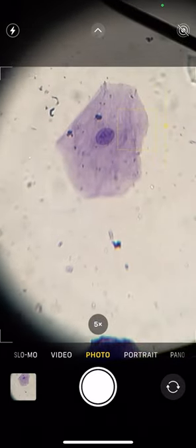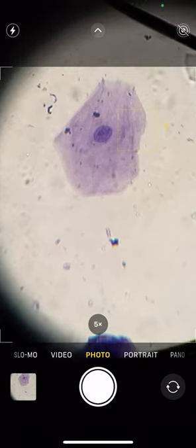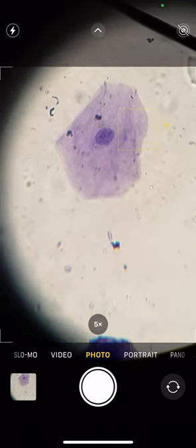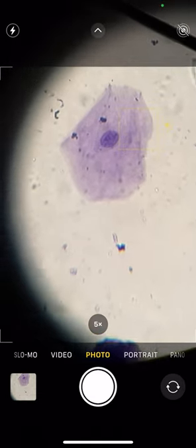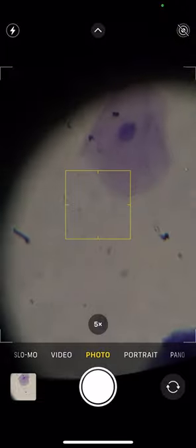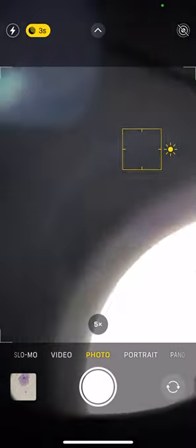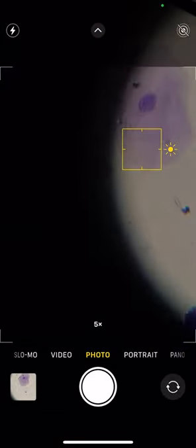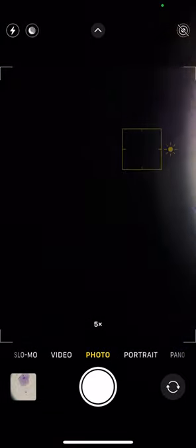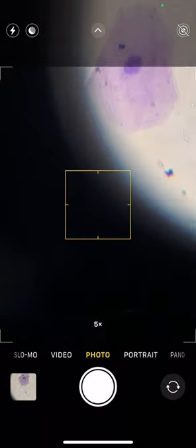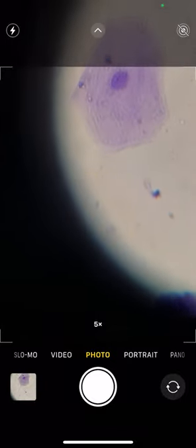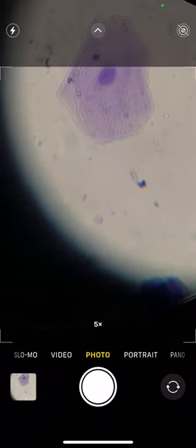There you guys go, human cheek cell right there. So that's the help with the human cheek cell lab. If you guys have any questions, you know, let me know, send me an email, I'll answer your questions. Otherwise, stay safe, stay healthy, and sorry about all the dizziness. Bye bye.